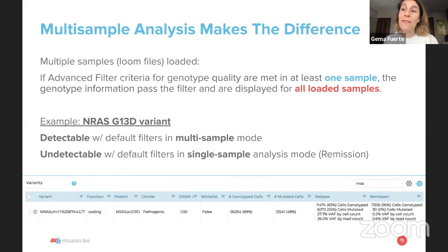And actually we will have a session, the support team, on missing variants. And that would be also really interesting because we will talk specifically about how to find variants that you are expecting and they don't show up at first. And a majority of them is the filters. You change the filters and they show up.